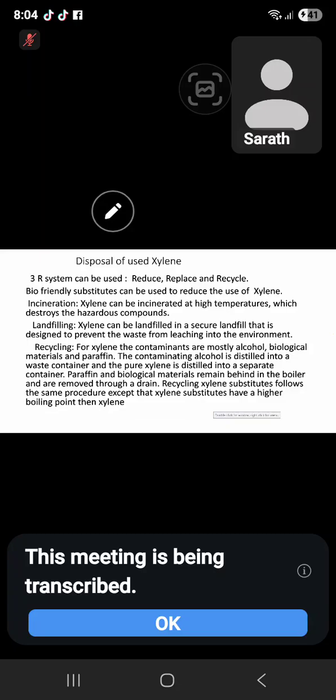Then, now that's a very critical issue, disposal of used xylene and chemicals. Xylene and chemicals both are harmful. Formalin is carcinogenic. Xylene is also carcinogenic. So you can't just dump it into your day-to-day wastewater, right? You have to pay attention to that. You have to apply the 3R system. What is the 3R system? Reduce, replace, and recycle.